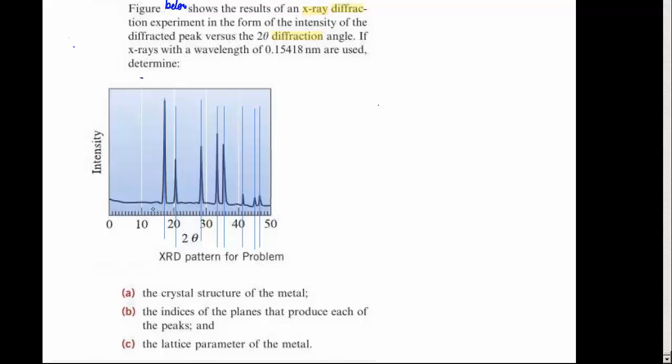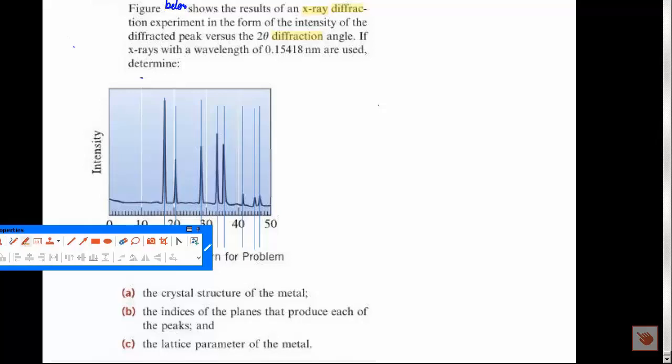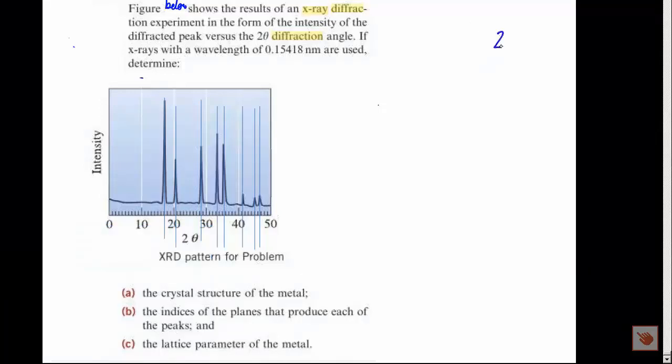The technique is extremely similar to what we just did before, except now we must read the 2 theta values off the graph, and in doing so we realize that in practical X-ray crystallography there is an uncertainty involved in determining the center of the peak, because each peak has a width that is dependent upon a number of things, including how finely powdered the sample is.